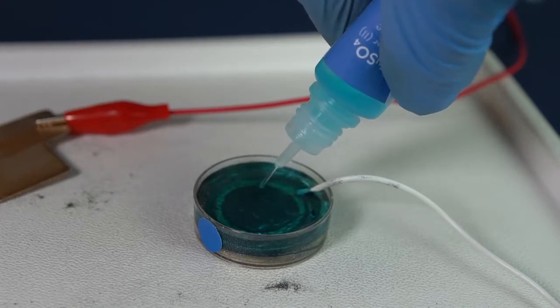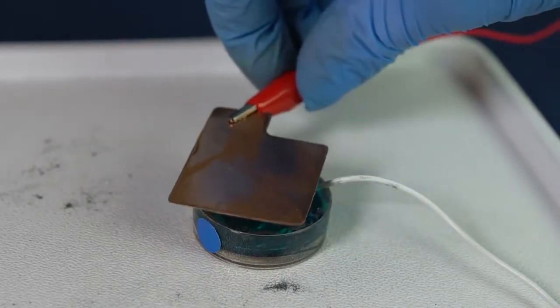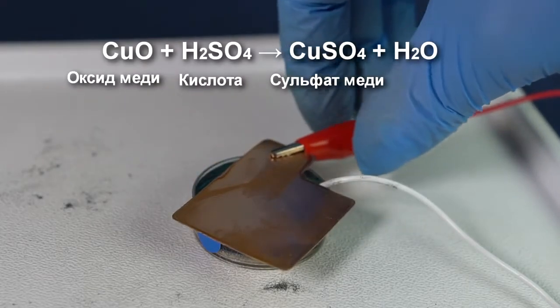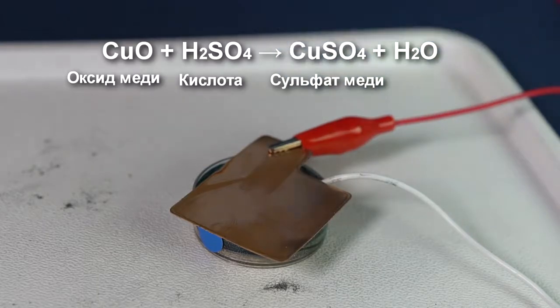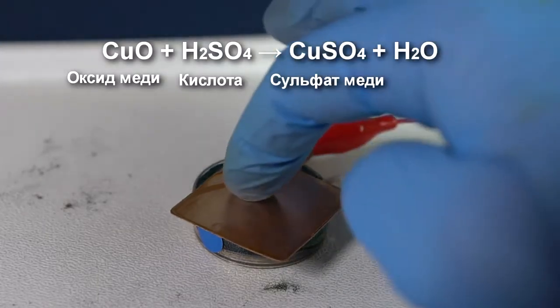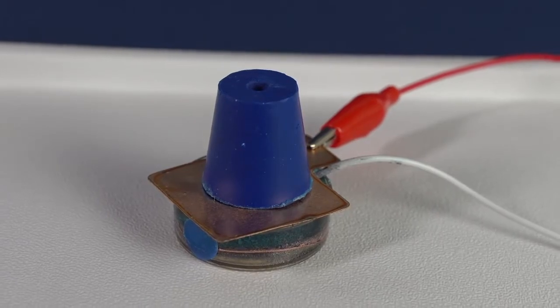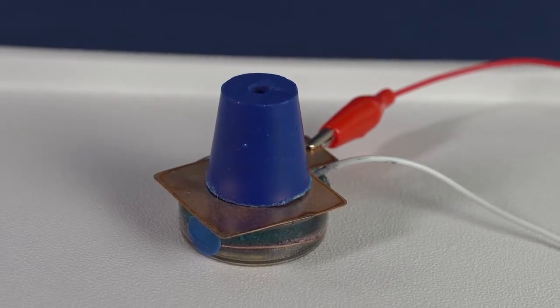When there are hydrogen ions among other ions, the solution is acidic. Copper oxide, which bothers the copper plate to participate in the reaction and give copper ions, is removed from its surface under such acidic conditions. To start the electrochemical reaction, put a rubber stopper on the plate and turn on the electric current.